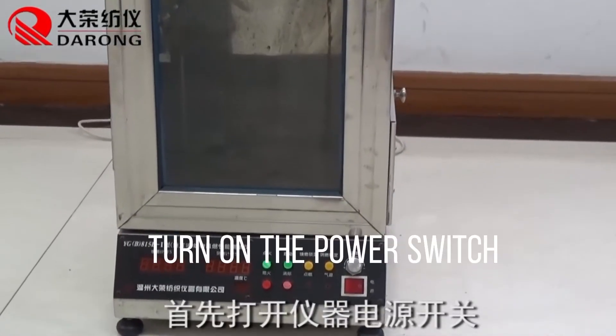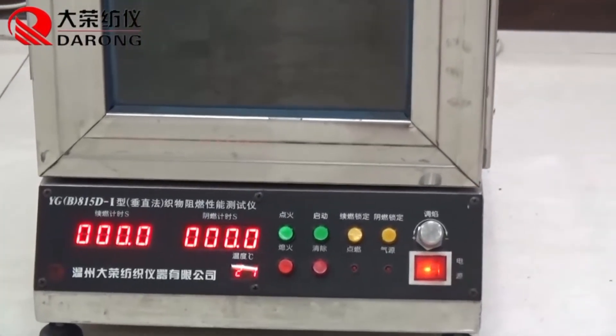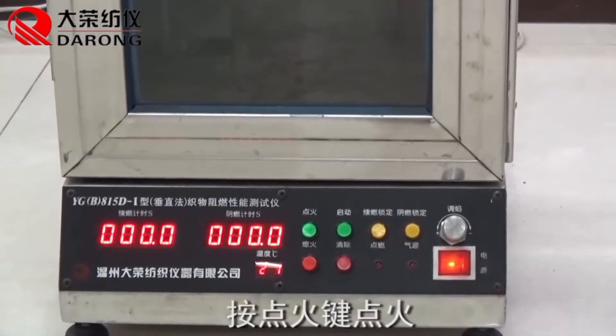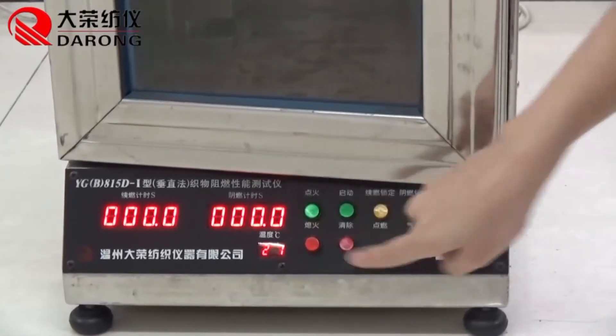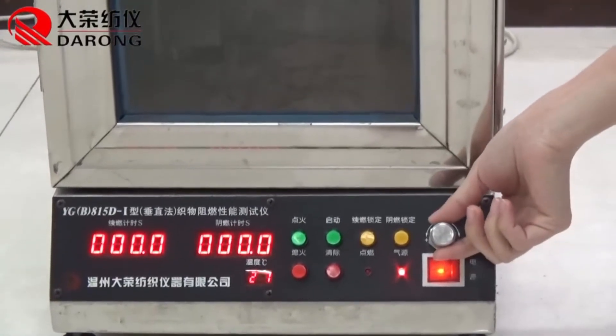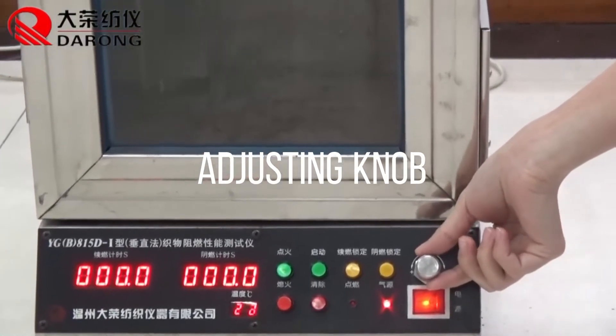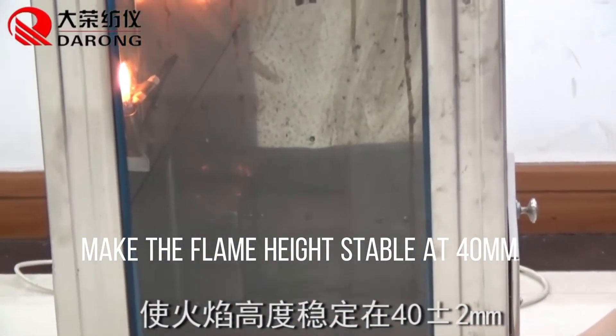Turn on the power switch. Press the ignition button. Adjust the knob to make the flame height stable at 40 millimeters.